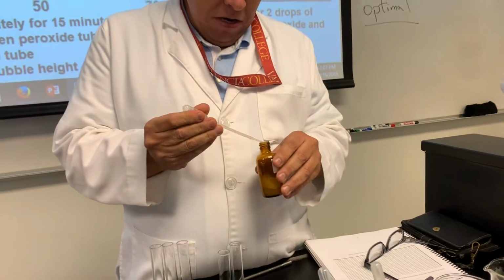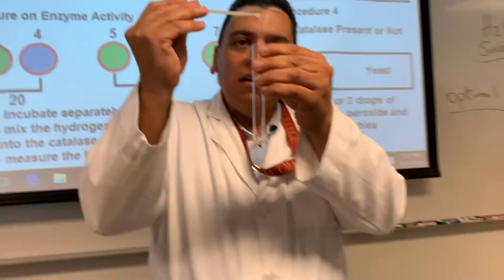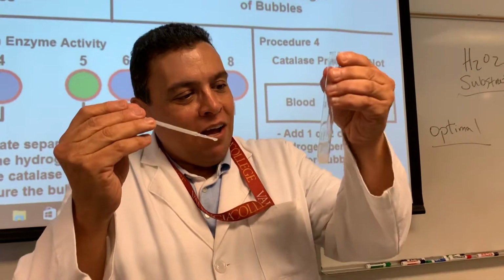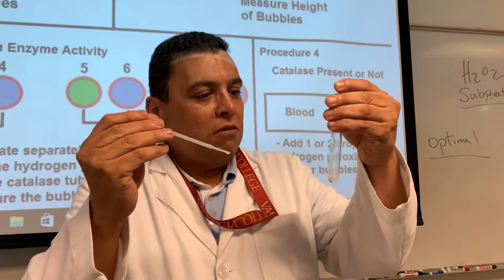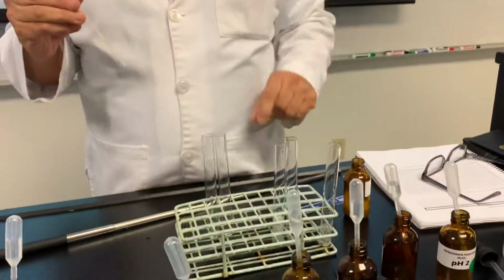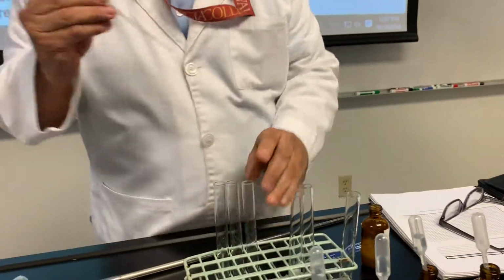7. What's your prediction? Will it be higher than 35 or lower? Higher or lower? Lower. Take my bet. It'll be higher. Wow. You have catalase, you guys. Ooh, that did not do well. You know what happened? It fell on the side. I was wrong. I'm repeating that one.